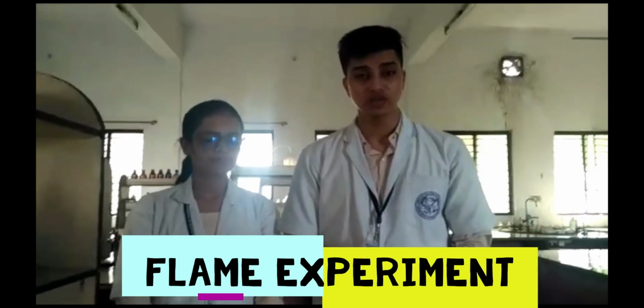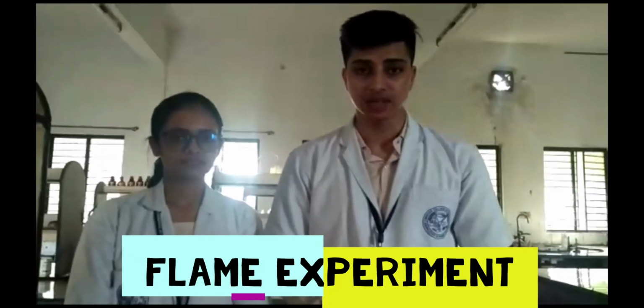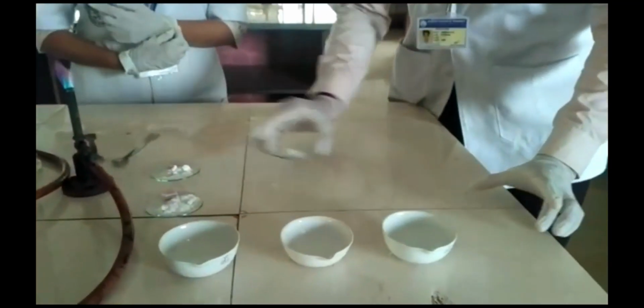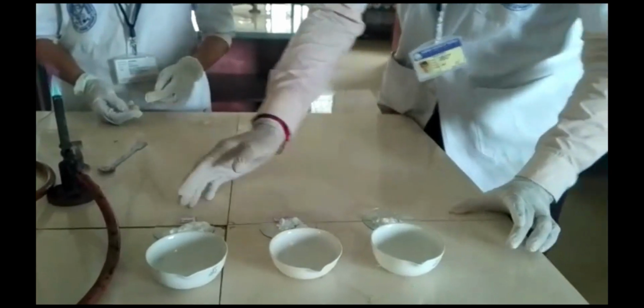Now we are going to perform the flame experiment. For this experiment, we require 3 china dishes and 3 chemicals. The chemicals that we are going to use are calcium chloride, aluminum hydroxide, and borax. Now I am going to place the 3 china dishes, and I am placing calcium chloride, aluminum hydroxide, and borax.